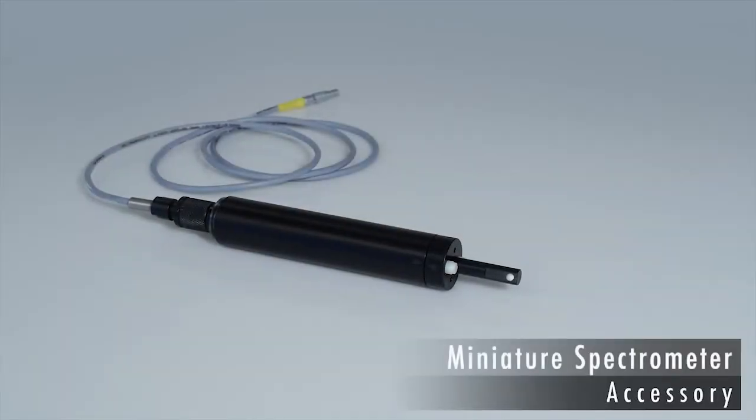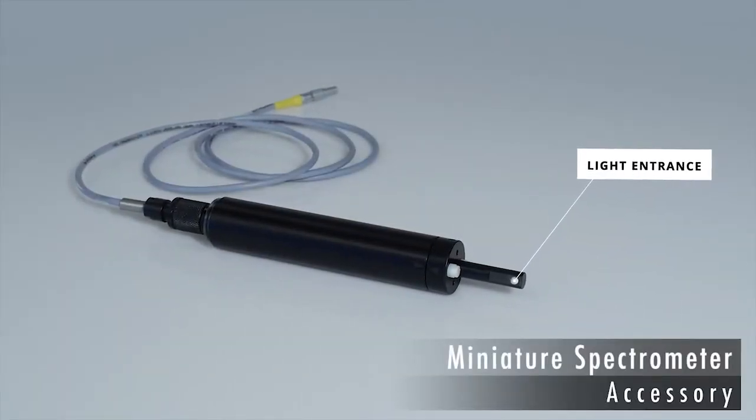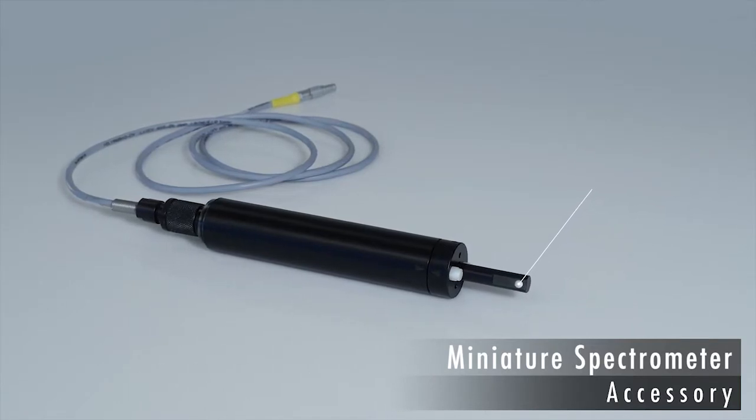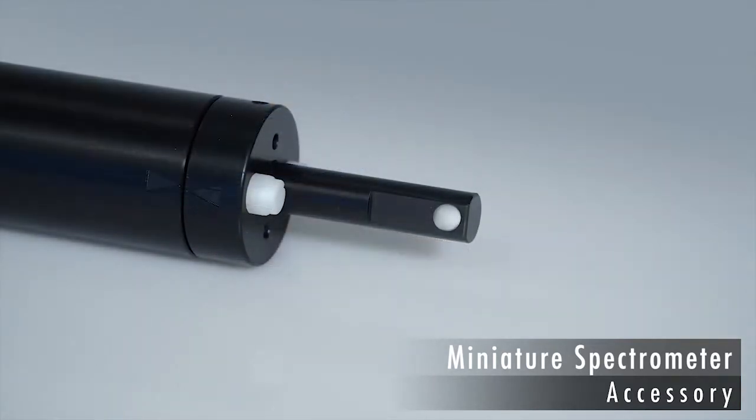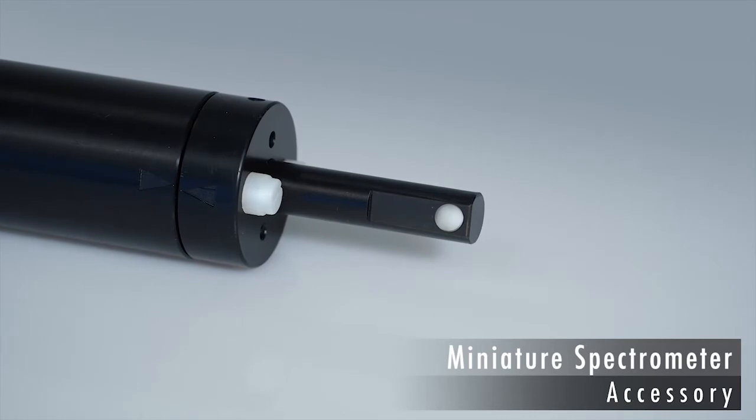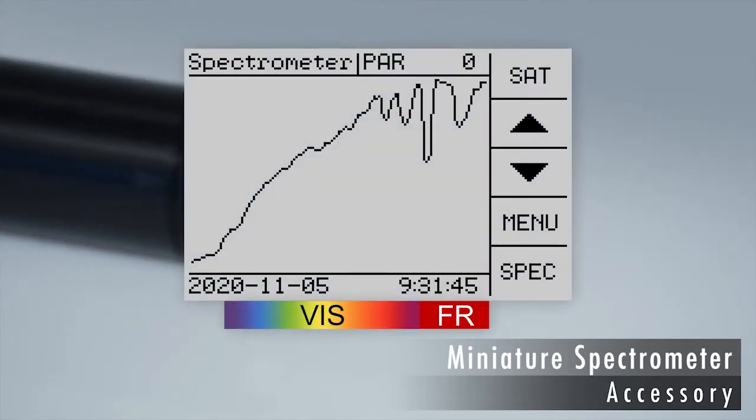The miniature spectrometer measures light spectra. The absence of moving parts makes the spectrometer ideal for outdoor studies. The spectrum includes the visible range which plants use for photosynthesis. It also covers the far red range, which is important for developmental processes controlled by the phytochrome photoreceptors.